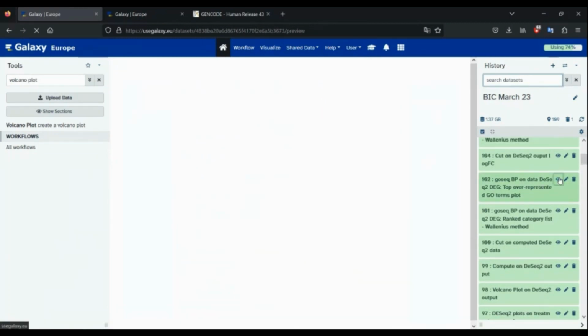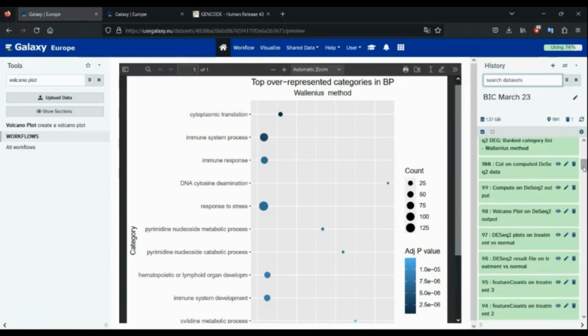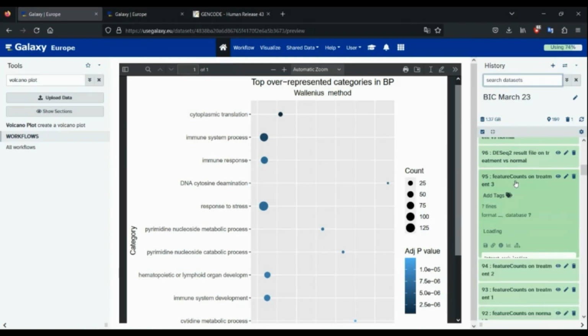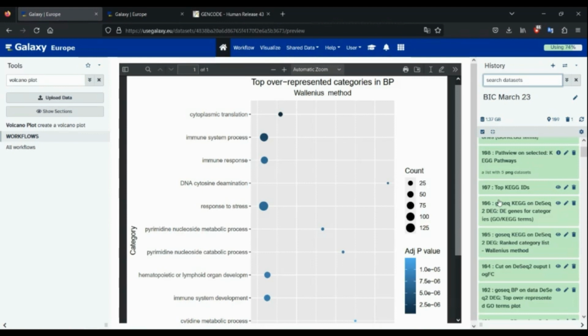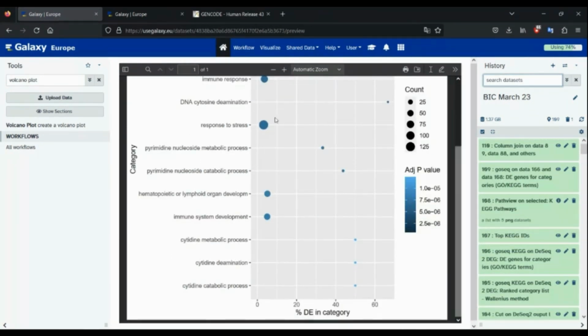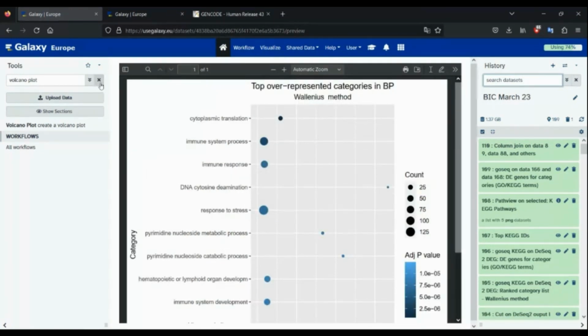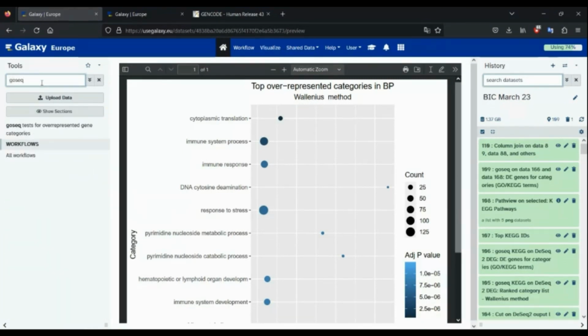This is a gene ontology of biological process. So with those genes, what I did was I simply used, remember when we calculated gene length from featureCounts. So using that gene length, I specified that. And by using the expression of the gene, the log fold change, and of course the FDR value, I calculated this. And the plot was generated by, you can write this down, the name of the tool is called GoSeq.